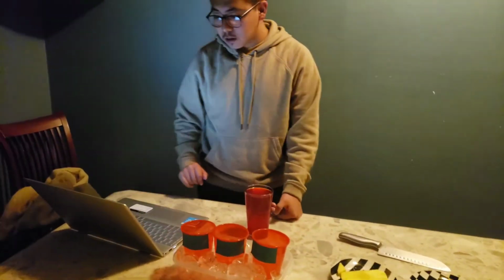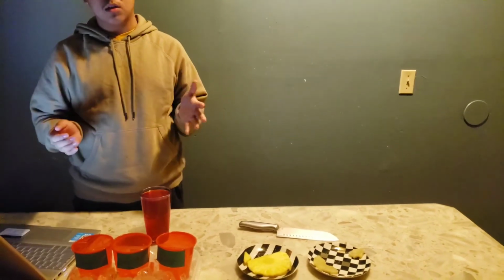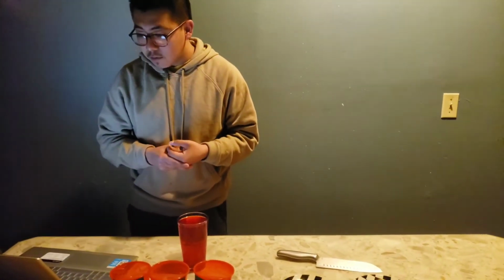My hypothesis is if the fresh pineapple is put into the gelatin, then there will be a catabolistic reaction because the protein in the fresh pineapple will break the gelatin apart. If the canned pineapple is put into the gelatin, then there will be an anabolistic reaction because the bromelain in the pineapple will not be as strong as in the fresh pineapple.